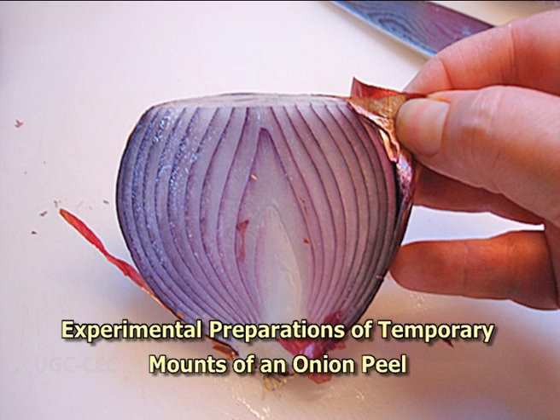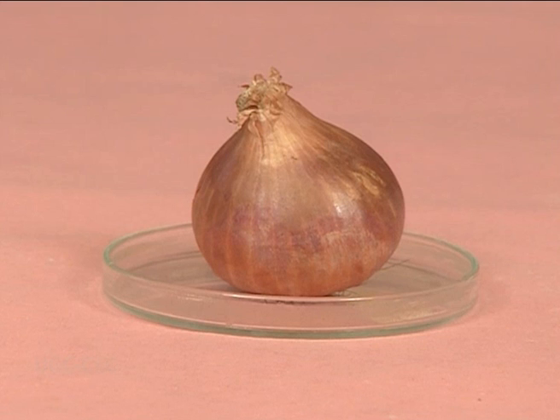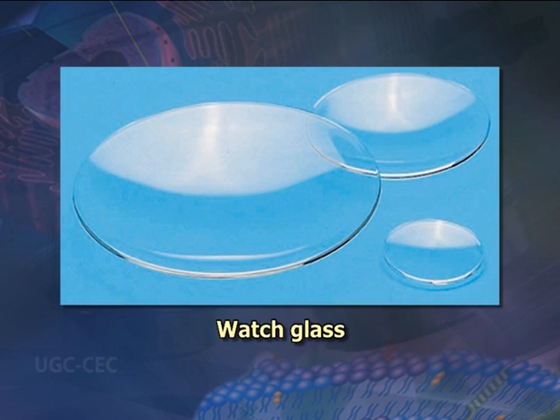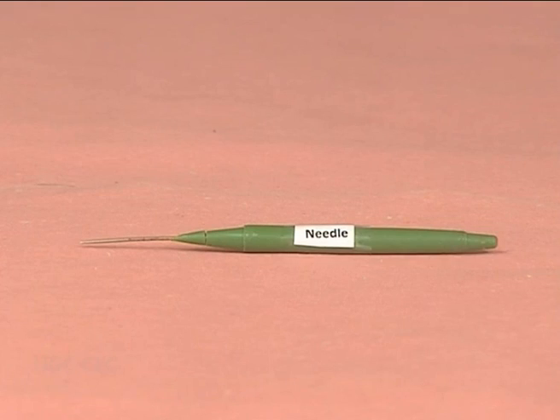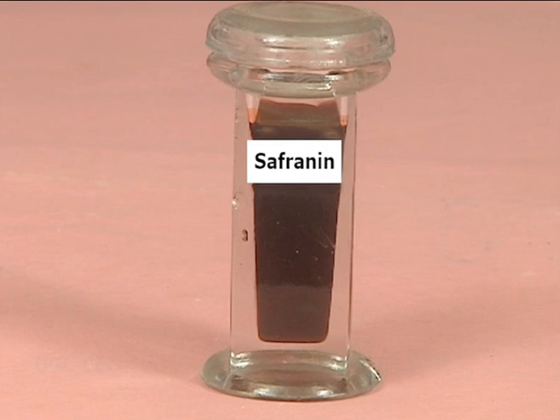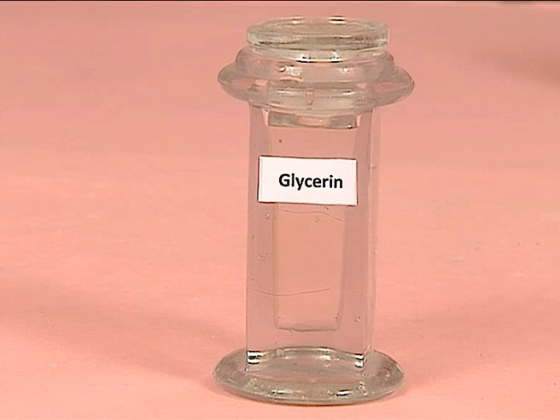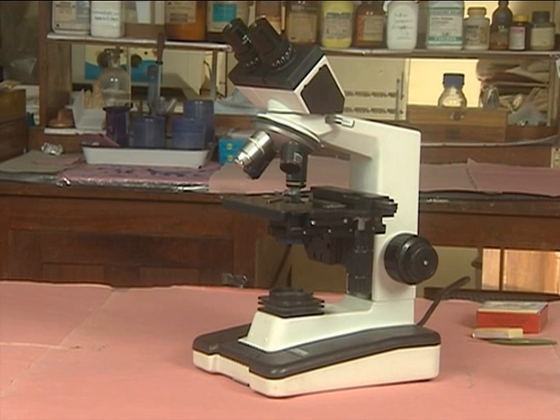Experiment: preparation of temporary mounts of an onion peel. Apparatus and materials required are an onion, glass slide, watch glass, cover slip, forceps, needles, brush, blade, filter paper, safranin, glycerin, dropper, water and a compound microscope.